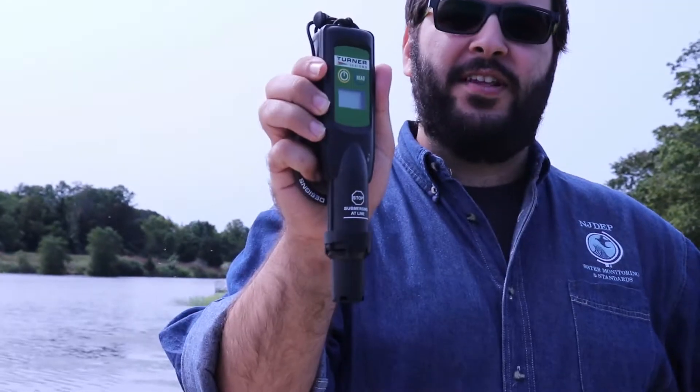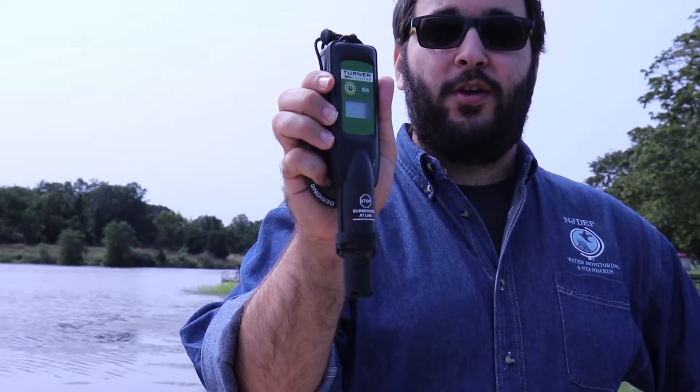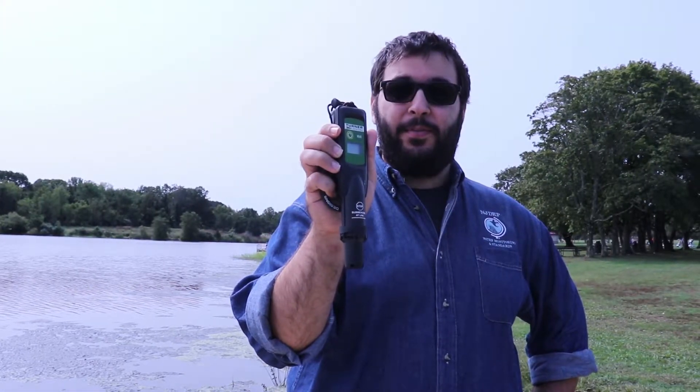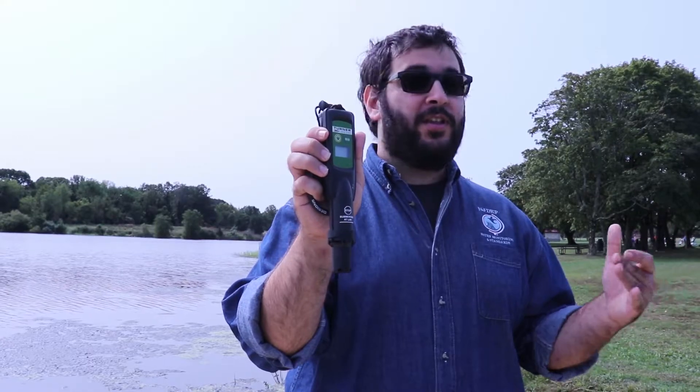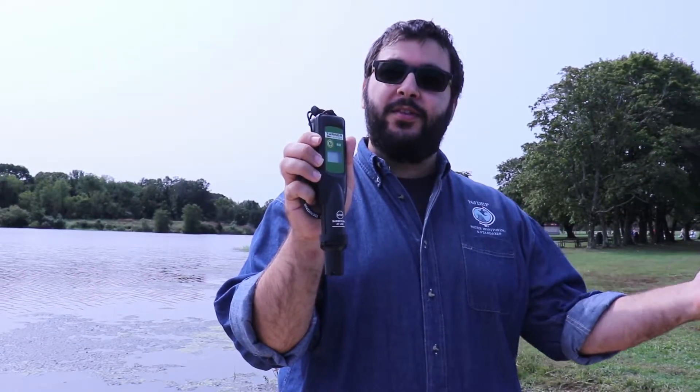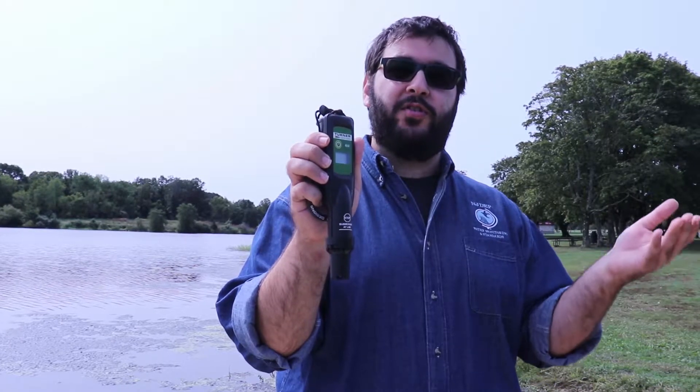This is known as a field fluorometer, also known as a phycocyanin meter. It is not necessary to use this to collect a HAB sample, and if you don't have one, it's perfectly fine. However, some people will have one — for example, certain state park offices, certain local health departments, or even some environmental consultants.